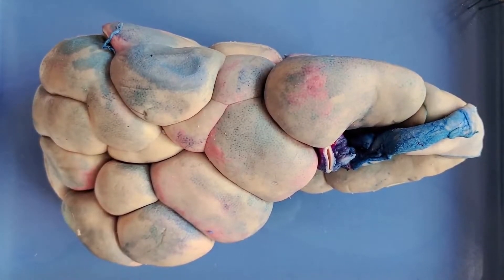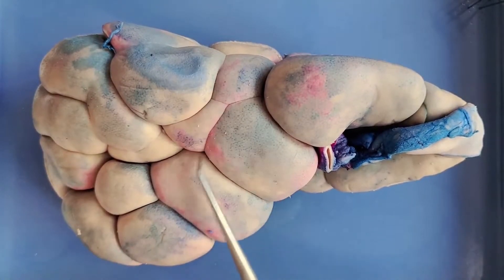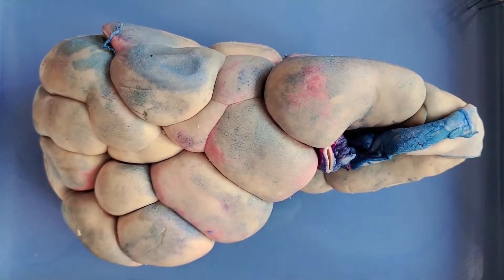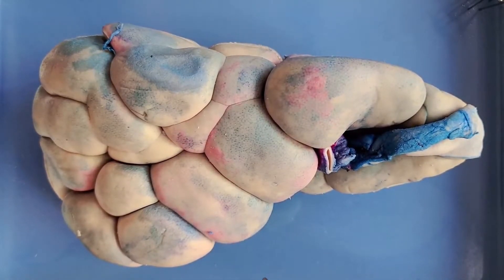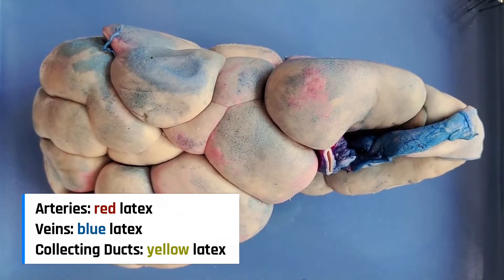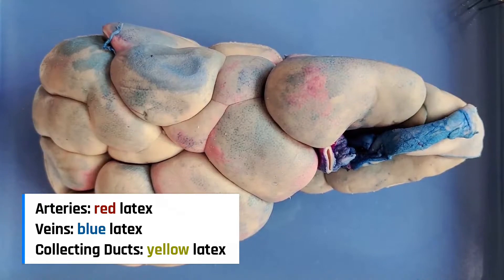Fun fact: horse kidneys are heart-shaped. The kidney also has a slight bluish-pink tinge to it, as you can see here. Normal kidneys aren't blue or pink, of course — this kidney is triple injected, which means it's been injected with colored latex to highlight some features. Arteries are labeled red, veins are labeled blue, and collecting ducts are labeled yellow.